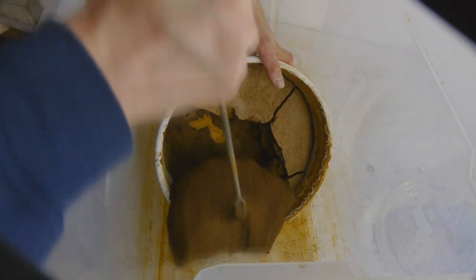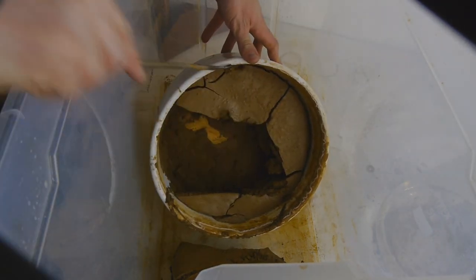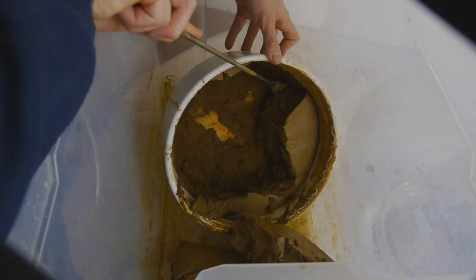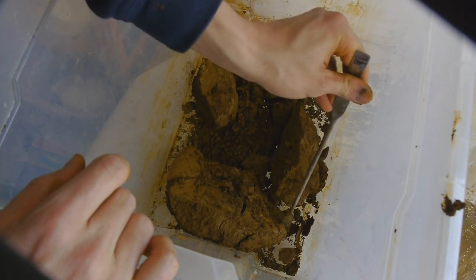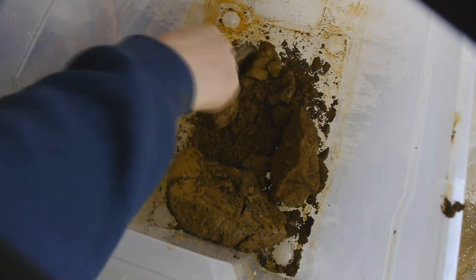Now let's try to remove the iron oxide from the filter paper, which is apparently working really nicely. And now we just need to spread this out so it can dry relatively quickly. To break up these large lumps.